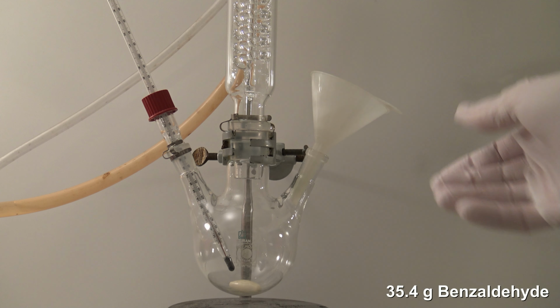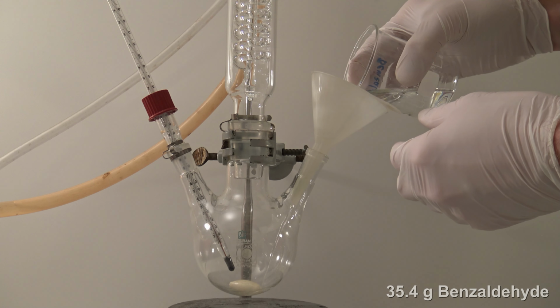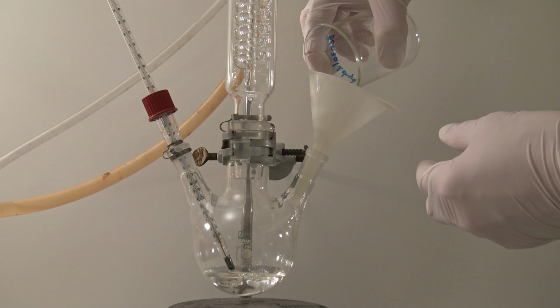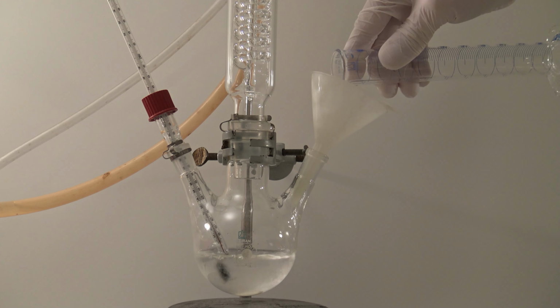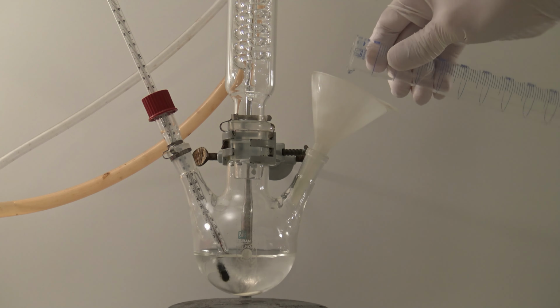First, 35.4 grams of benzaldehyde were added to the flask. To this 70 milliliters of methanol were added. Before addition of the next compound, the condenser and hot plate were turned on.